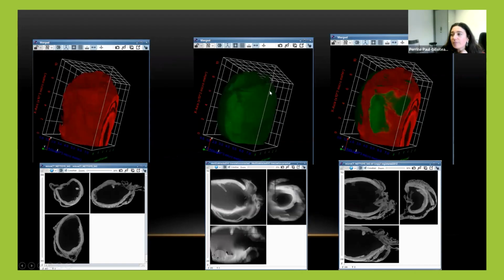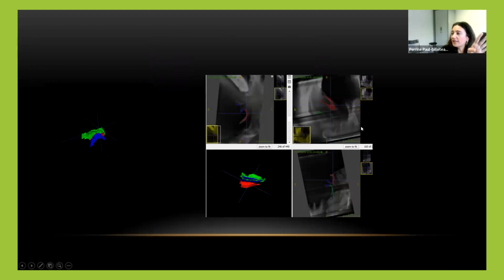And we use that, for example, here to link the micro-CT to this image obtained from the microtome and the camera in front of the microtome. So you have two 3D volumes, which are kind of easy to register, at least realign, even if there is some deformation in that case.